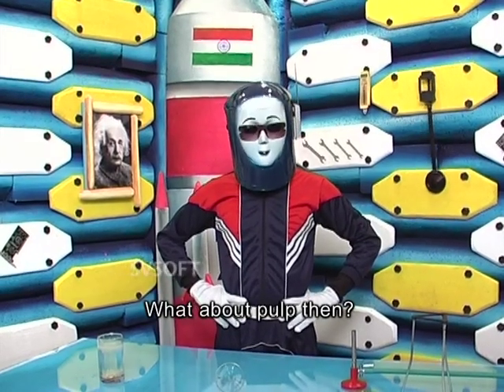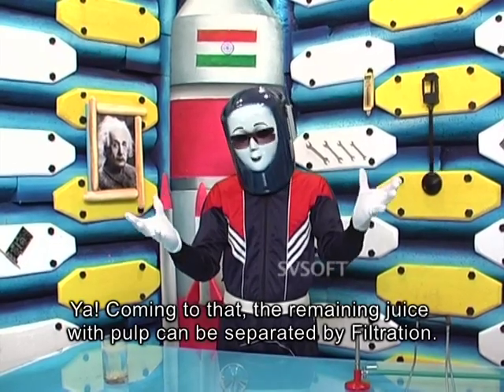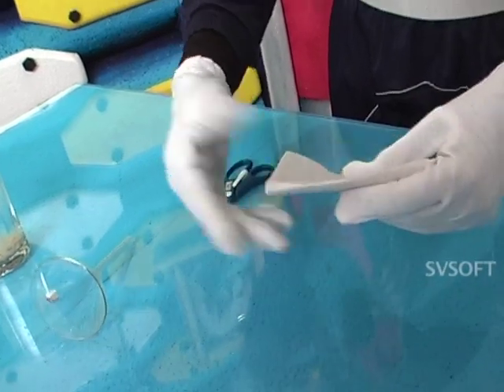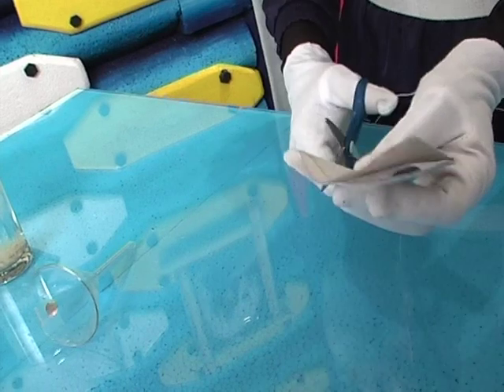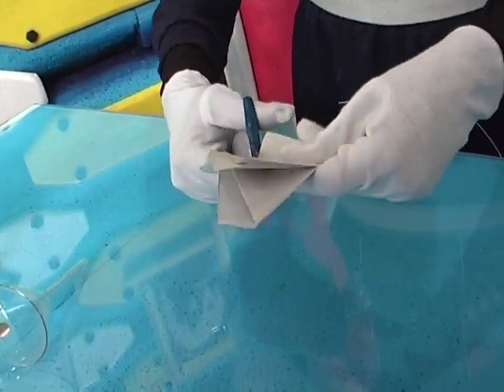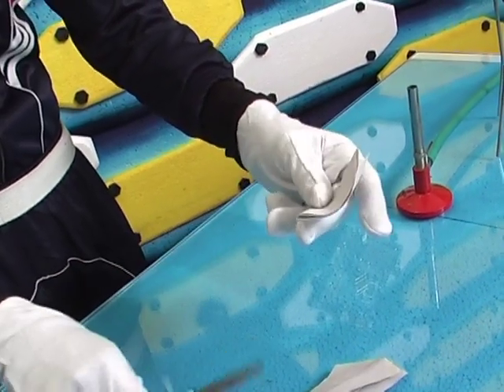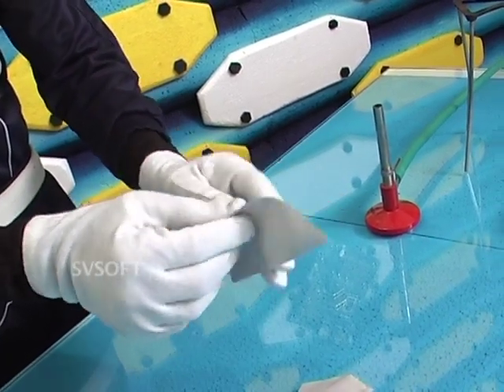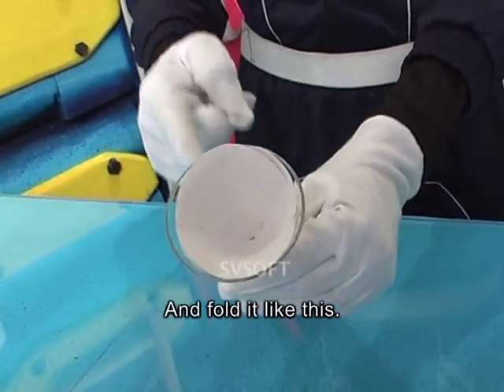What about pulp then? Yeah, coming to that. The remaining juice with pulp can be separated by filtration. Take filter paper, cut it in circular shape, and fold it like this.